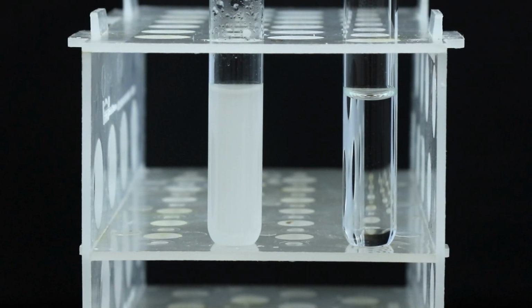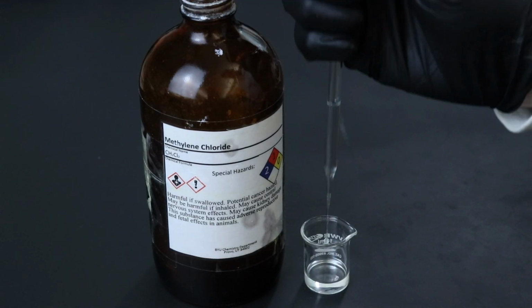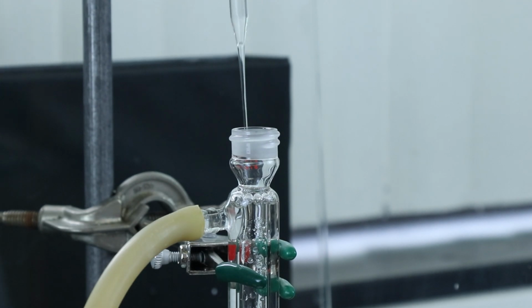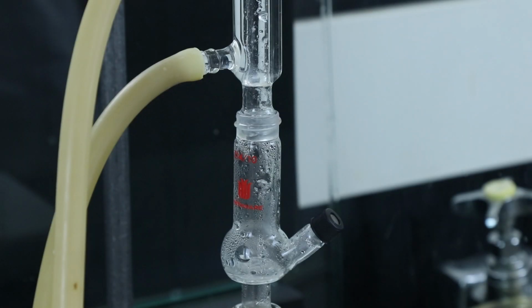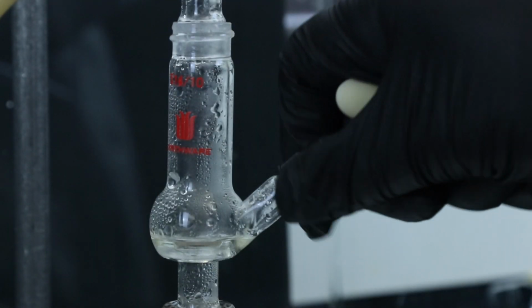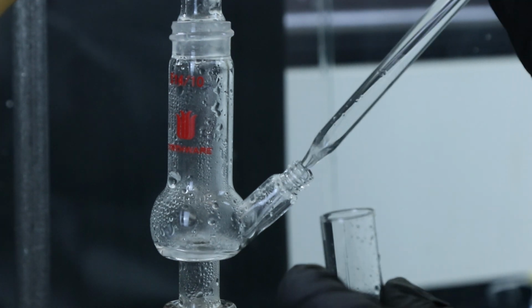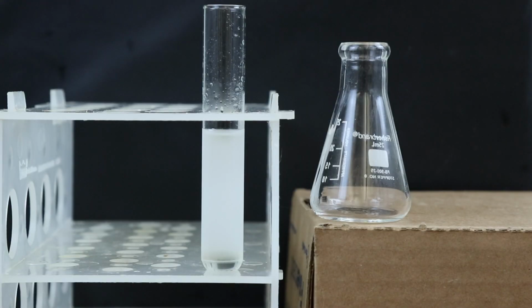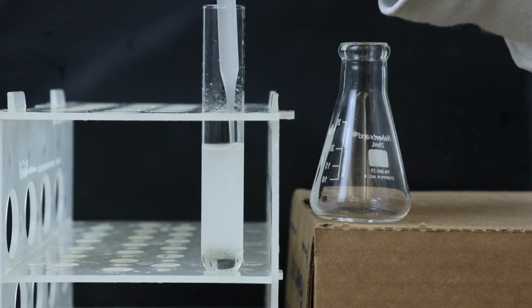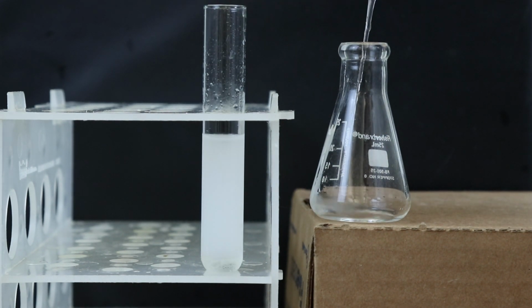Now I'm good to move on, so I'm going to start getting some methylene chloride to do the extractions. But before adding it to the test tube, I'm going to rinse the apparatus to collect any cinnamaldehyde that would be adhering to the glass surfaces. Then I'll just remove that from the Hickman still and add it to the test tube containing the distillate. Now we can see the organic phase below the aqueous one, so I'm just going to add a little bit more methylene chloride, mixing the two phases together really well, and then transfer the organic phase over to an Erlenmeyer flask.